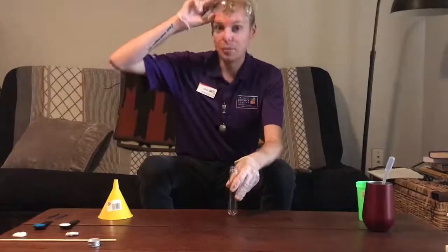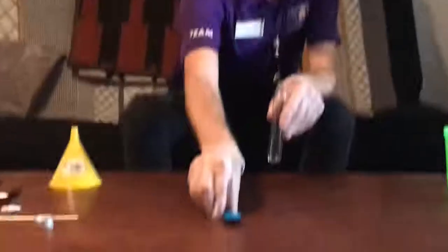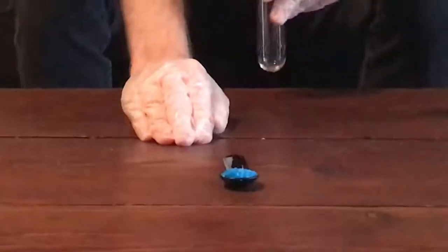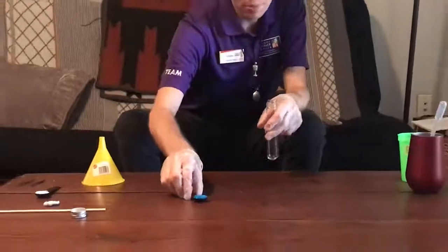The first thing, I'm going to put my PPE on to make sure that I'm staying safe. Then I'm going to take my compound, which looks very bright blue and is very pretty. This is copper sulfate. So this is copper, sulfur, and oxygen atoms. And I'm going to take 5 grams of copper sulfate.